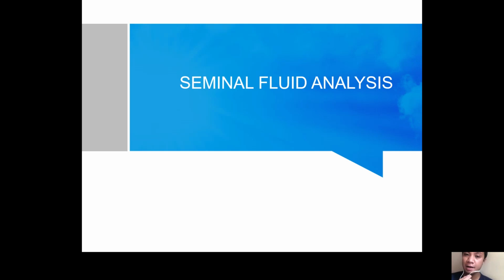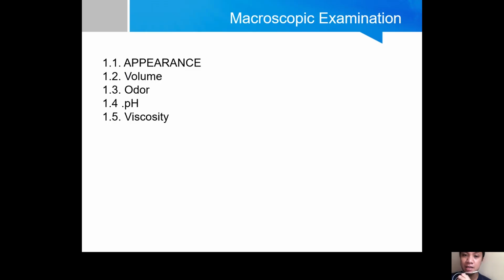Okay, we're going to take up today the seminal fluid analysis. Our seminal fluid analysis is divided into your macroscopic examination, or simply your physical exam, and then your microscopic examination. Upon receipt of the specimen in the laboratory, you need to take note of the following macroscopic parameters.